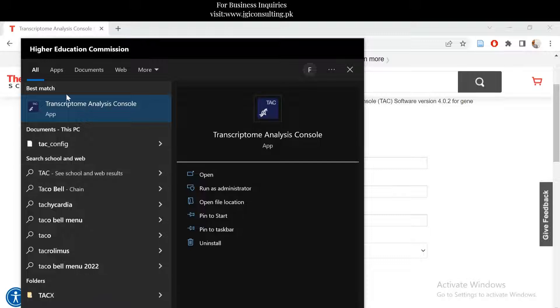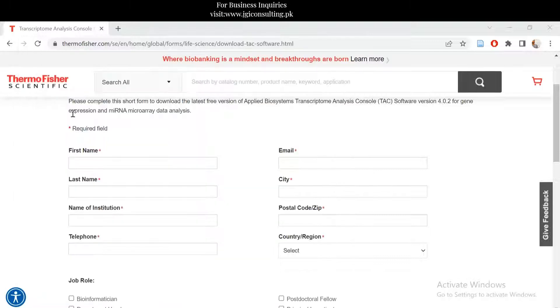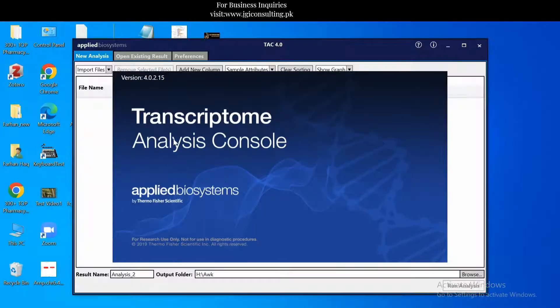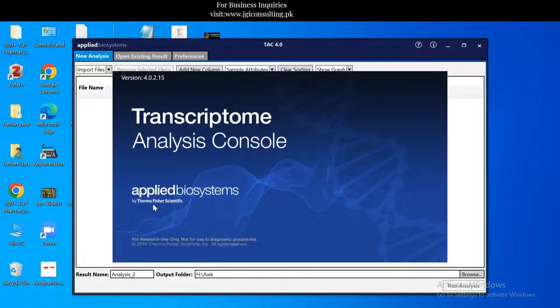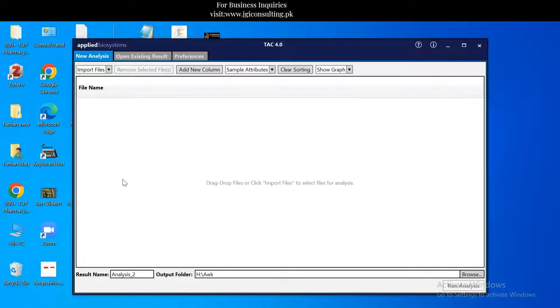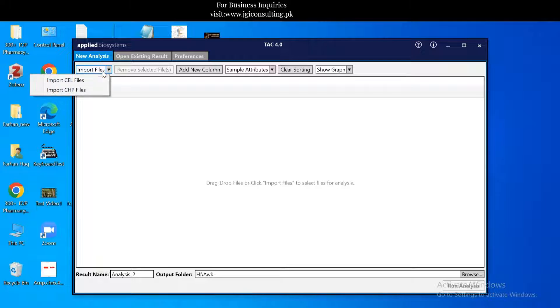For example, if I just show you, this is after downloading and installing it. This is actually the console of that, and here you can perform analysis, you can import your files, CEL files.